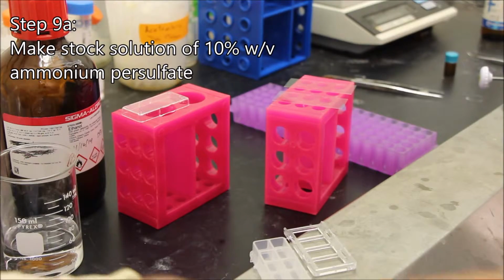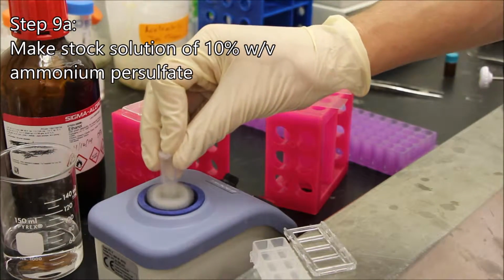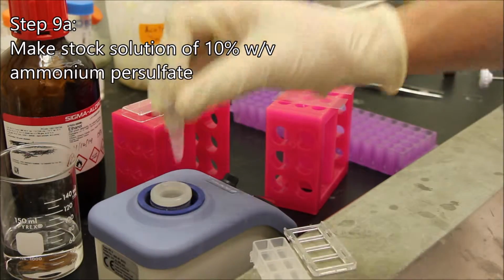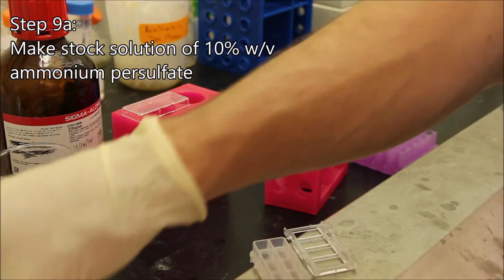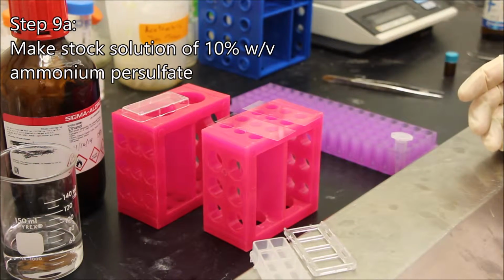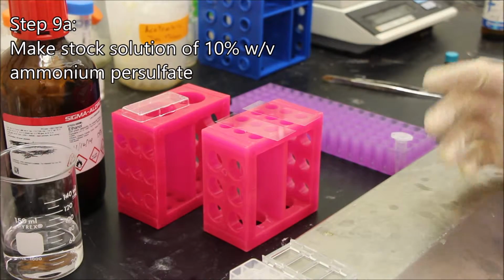Close it, and then vortex it. Make sure it all goes into solution. And this ammonium persulfate will be the catalyst to form the polyacrylamide gel. So now that we have that, now that we have our slides ready, we just need to wait for the sonication to finish.